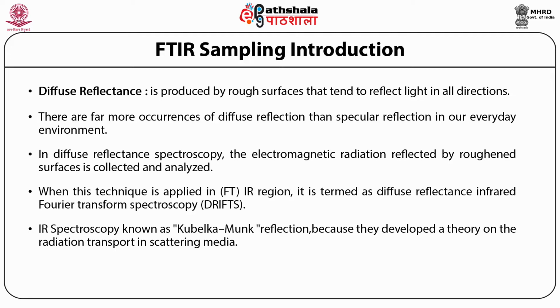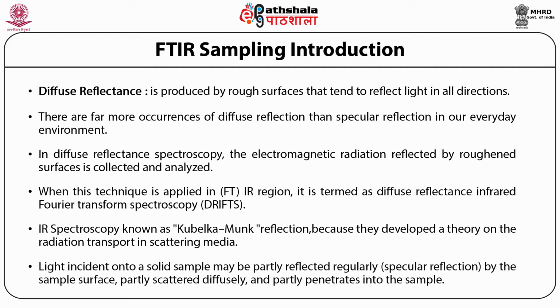Now here a light is incident onto a solid sample which may be partly reflected regularly, that is specular reflection, by the sample surface, partly scattered diffusely and partly penetrates into the sample.